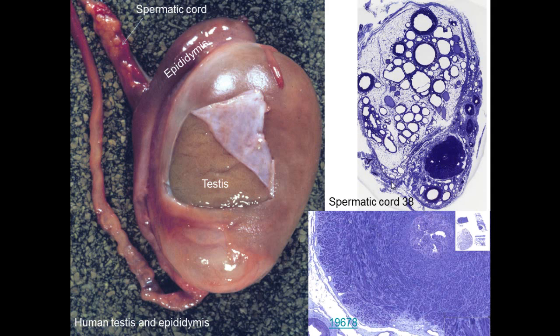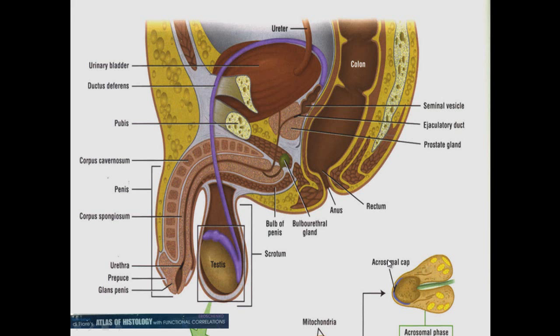Here we see a cross-section of a spermatic cord, ductus deferens there. You see rich vascular supply. This is blood vessels, nerves, lymphatics, with the ductus deferens as well, with smooth muscle, the inner longitudinal, outer longitudinal, and middle circular, I should say. And so through the ductus deferens, sperm come, and then they go into the ejaculatory ducts of the prostate.